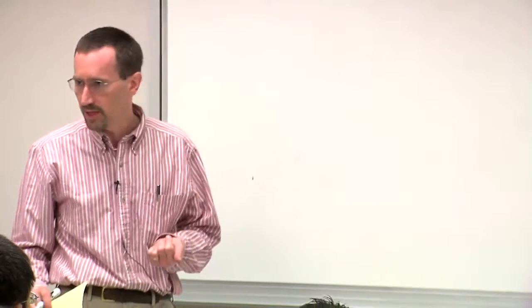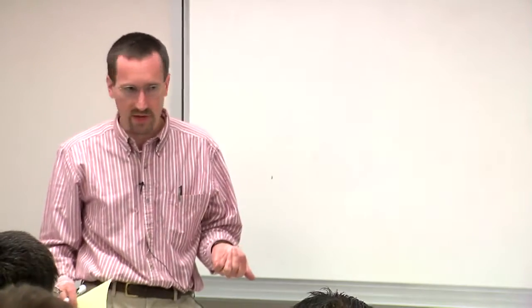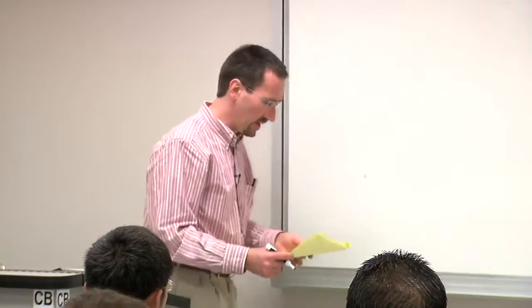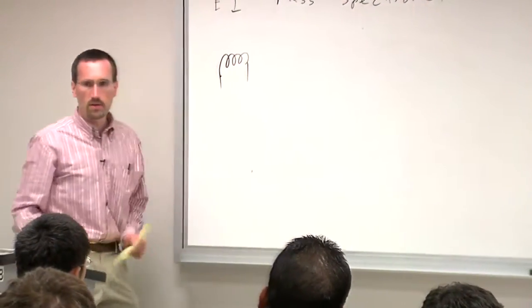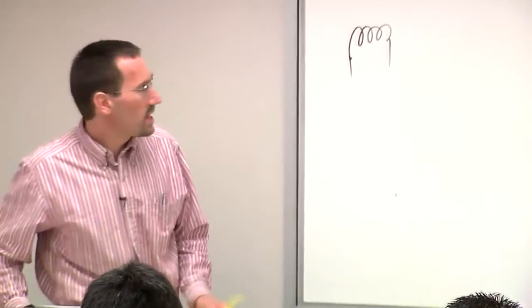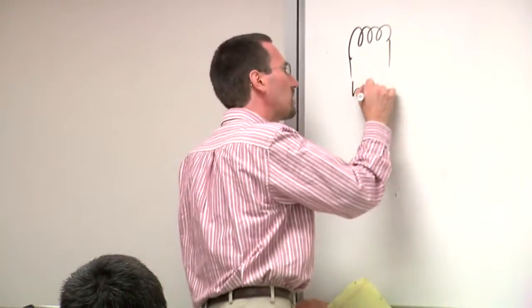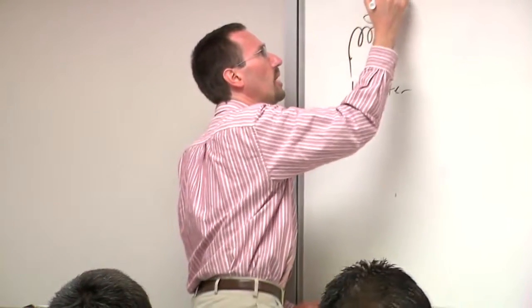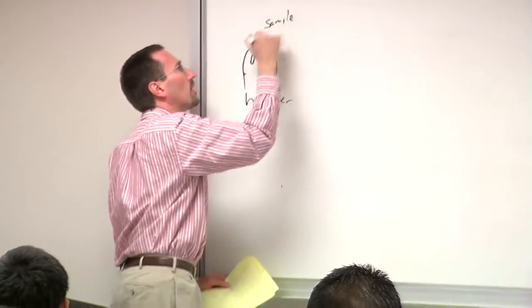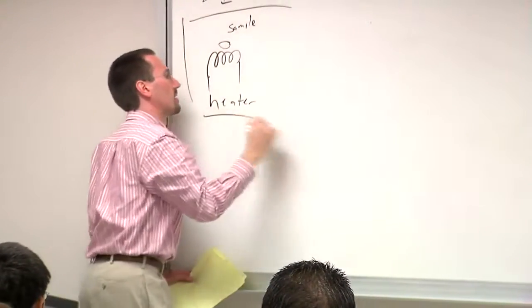In fact, for common techniques that an organic chemist would use, it's the only experiment where you're doing it in the gas phase. IR, you could do gas phase IR, but most of the molecules organic chemists work with are going to be in the liquid phase or the solid phase or the solution phase. So the first problem is, how do you get the molecule into the gas phase? So typically what you do is you have a heater, a coil of wire like a filament, and you put your sample on the filament, and you have this in a vacuum.